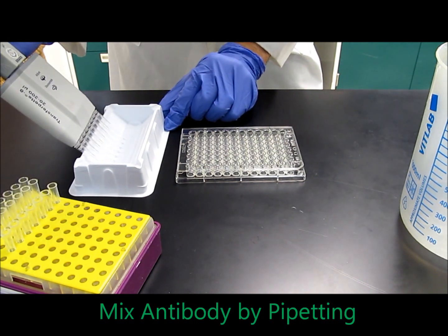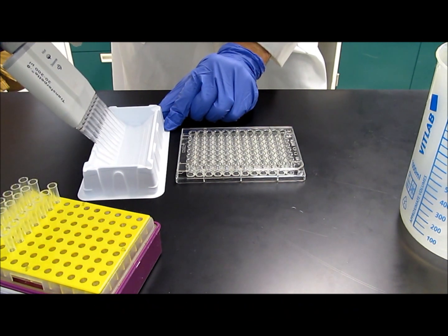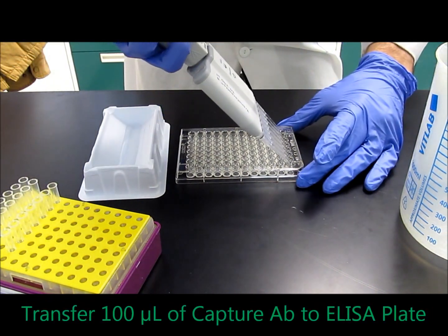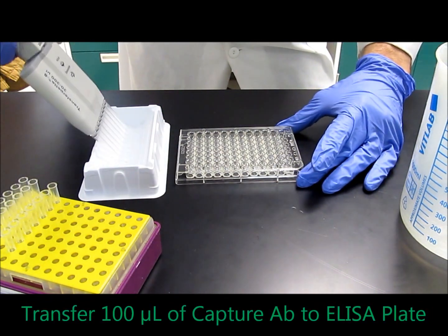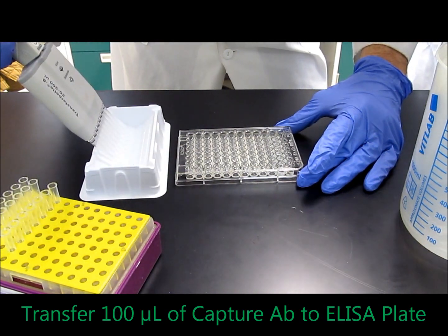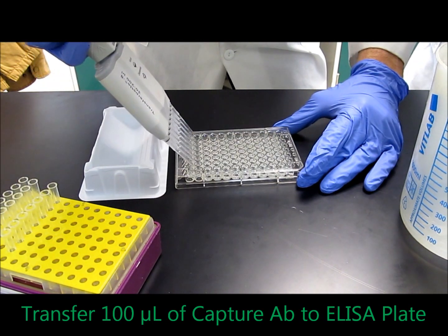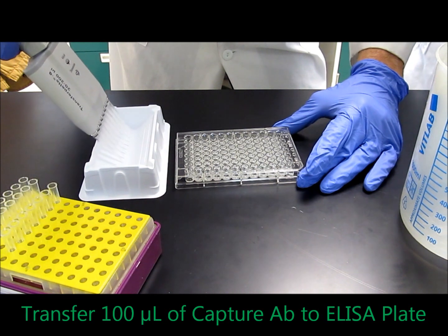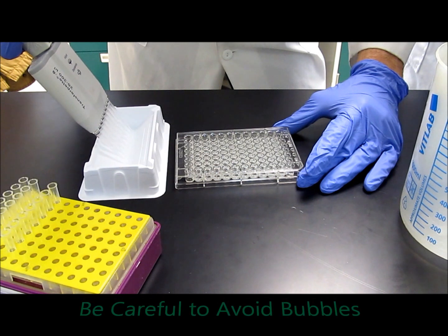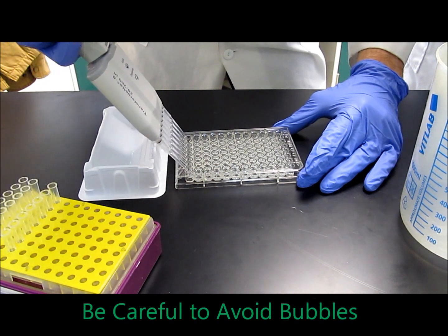Once you feel that it's well mixed, carefully take 100 microliters without getting any bubbles and start pipetting it into each well of the 96-well plate. You're just going to keep going back and forth until you finish all the wells. The last well is usually the trickiest because you're almost out of reagent, so be careful not to get any bubbles. Once you're satisfied that there are no bubbles, just add it.